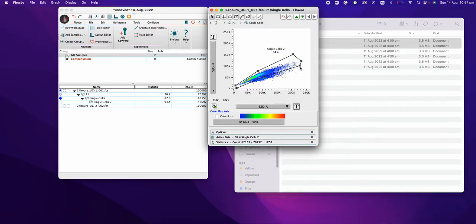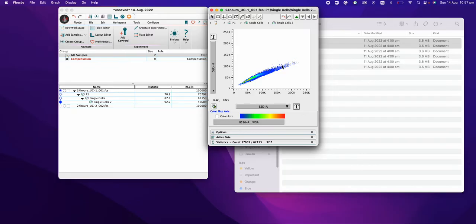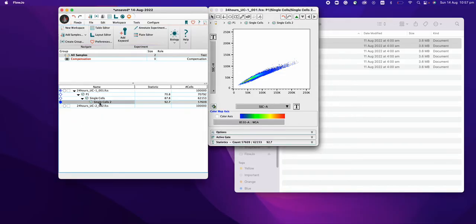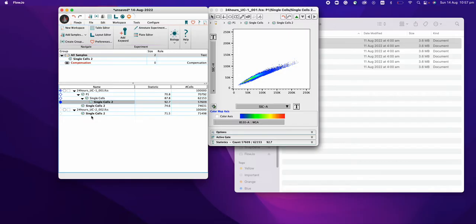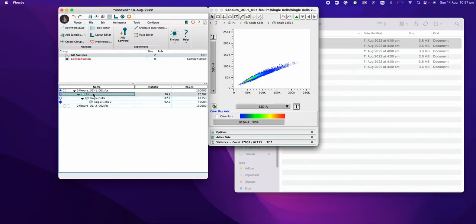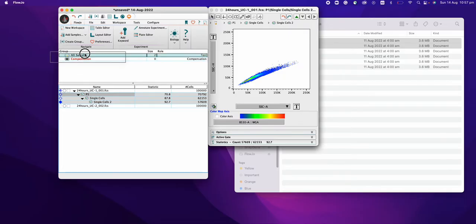Follow-up cleaning up, we'll just adjust. That's the single cell we found here. We have to go back and then select all the things here — apply it to all samples. It should be okay.